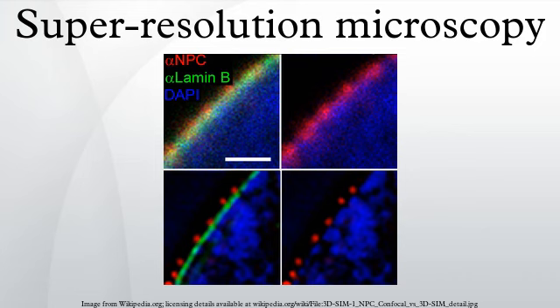A further example for the use of SPDMPHYMOD is in analysis of tobacco mosaic virus particles or the study of virus-cell interaction. Based on singlet-triplet state transitions, it is crucial for SPDMPHYMOD that this process is ongoing and leading to the effect that a single molecule comes first into a very long-living reversible dark state, from which it returns to a fluorescent state emitting many photons for several milliseconds before it returns into a very long-living, so-called irreversible dark state.